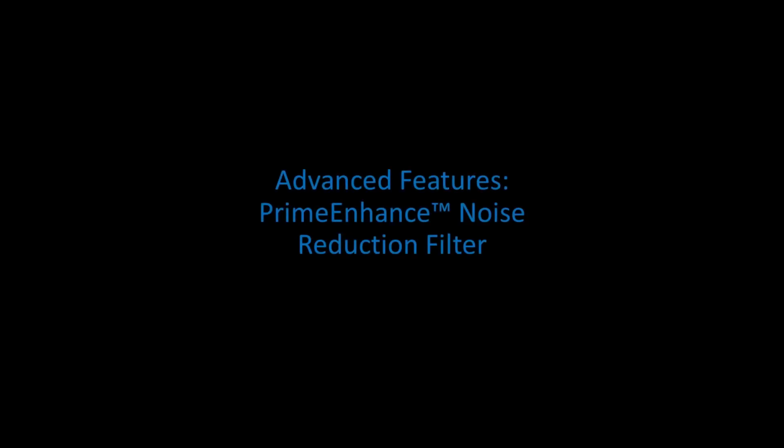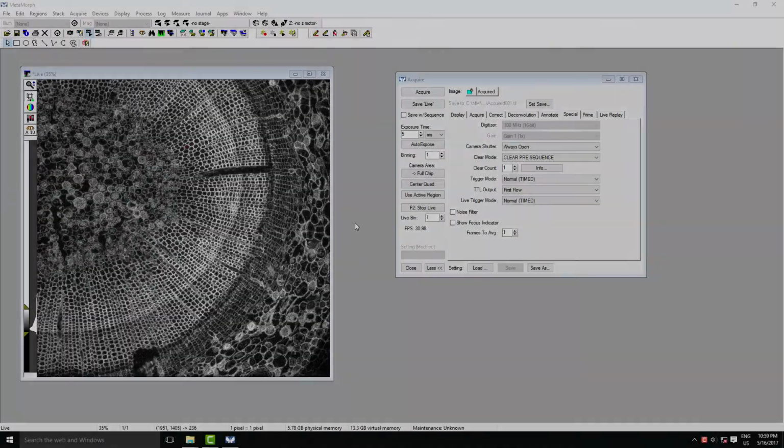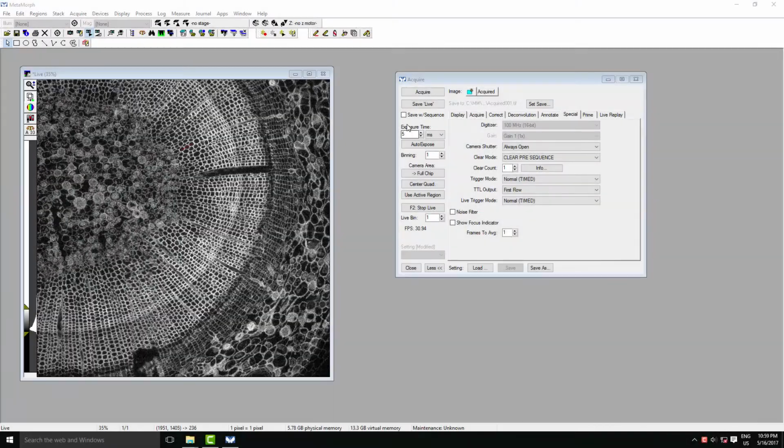Finally, we'll look at one of the advanced features of the Prime camera, and that's our PrimeEnhance denoising algorithm. So in order to activate this, we go back and reactivate the noise filter that we have to deactivate when loading MetaMorph. So we go to the Special tab and activate Noise Filter. And as you can see, at this fairly low exposure time of 5 milliseconds, we get an instant increase in contrast and the quality of our signal. You can see the random noise just disappears. All the intensity peaks are preserved, we can still use the values and measure the values, and our structures are preserved.